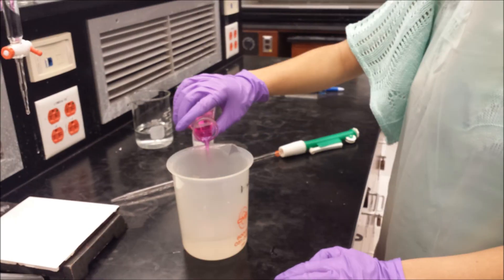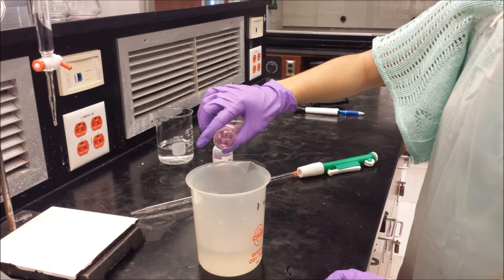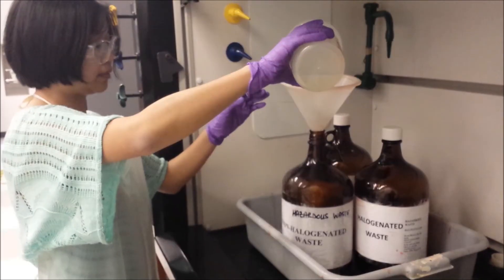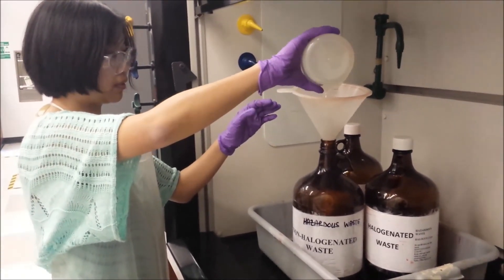Clean the Erlenmeyer flask and reset the trials two more times. Refill your burette after each finished trial. Discard your finished titration into the non-halogen waste container.